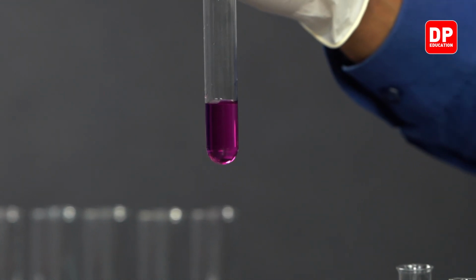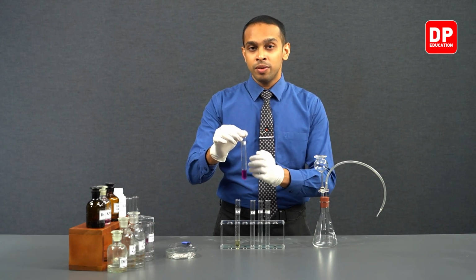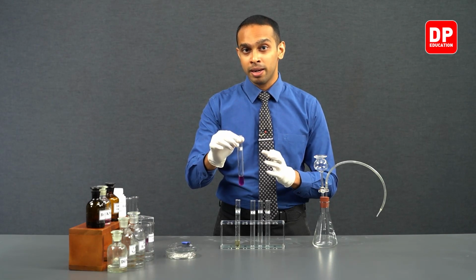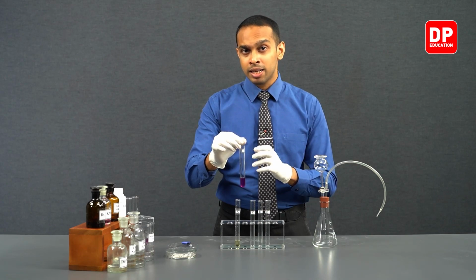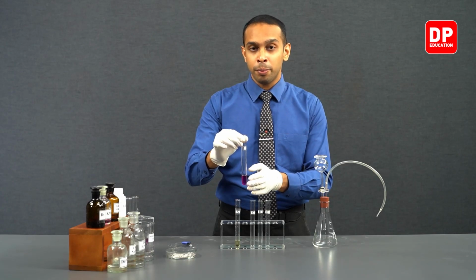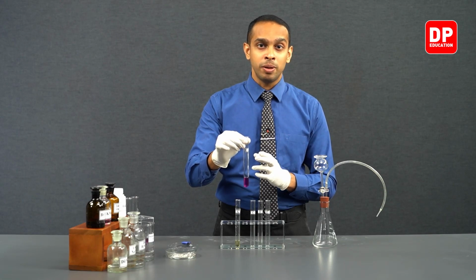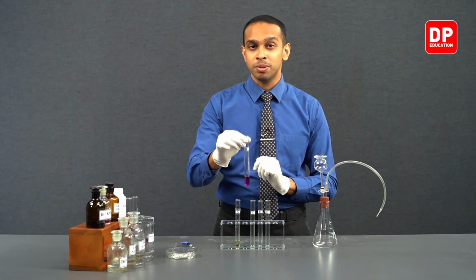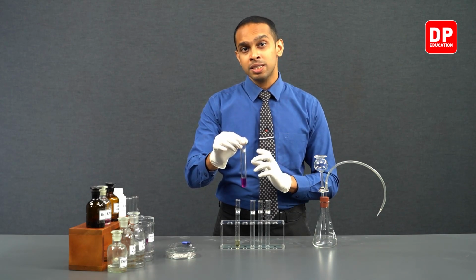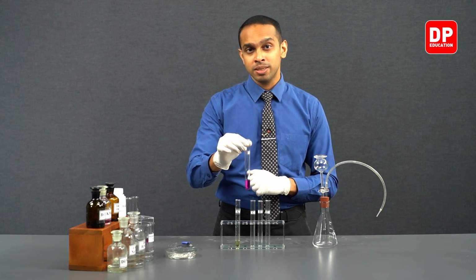That is a positive answer for the Baeyer's test. If the color changes from purple to brown, that indicates that the hydrocarbon we reacted with this alkaline potassium permanganate was unsaturated. So, Baeyer's test can be used to identify unsaturated hydrocarbons.